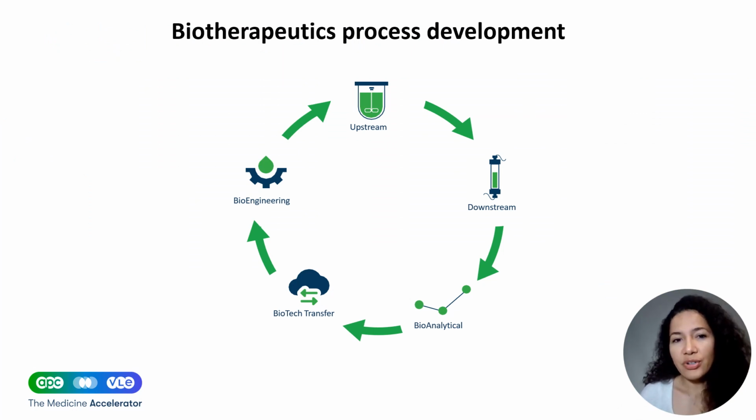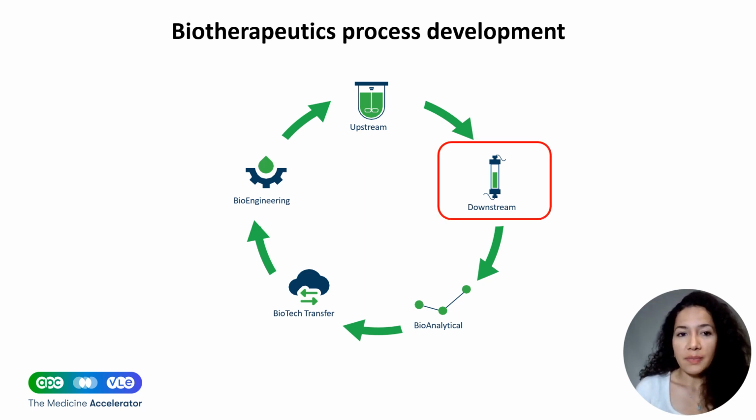As the demand for biologics continues to rise, so does the pressure on the biotherapeutics life cycle, which includes bioanalysis, biotech transfer, bioengineering, upstream, and downstream processing. Downstream processing is the focus of this webinar, more specifically chromatography.